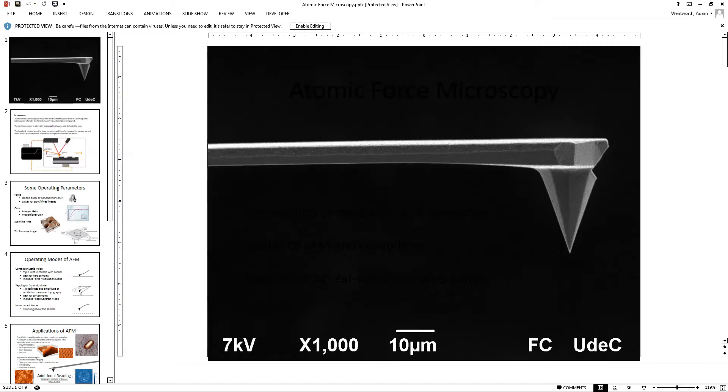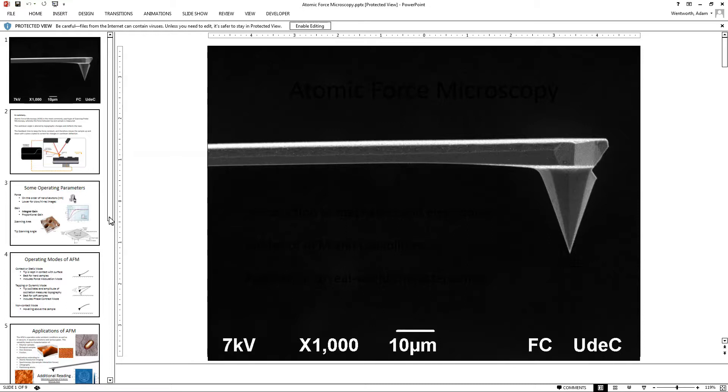All right, so this video is about the Nanosurf EasyScan 2 software used to operate the EasyScan Educational Atomic Force Microscope.